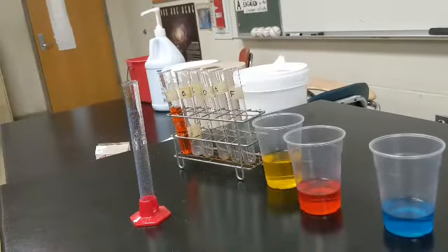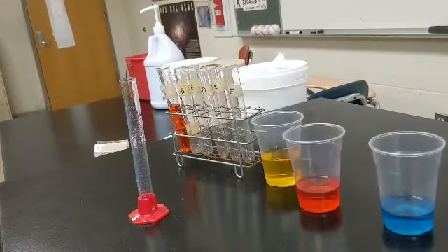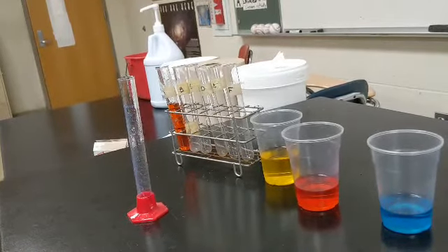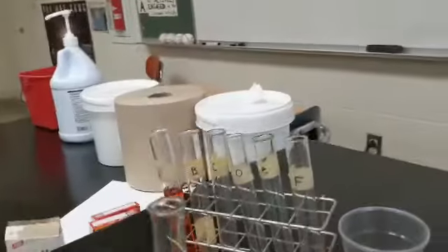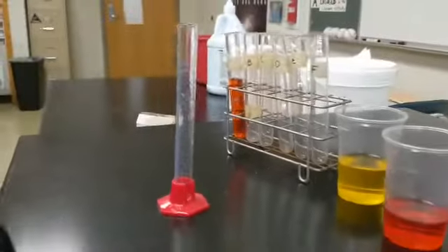Step 2 in the procedure says, into test tube C, add 18 milliliters of yellow water. 18 this time. All right, so let's try that.